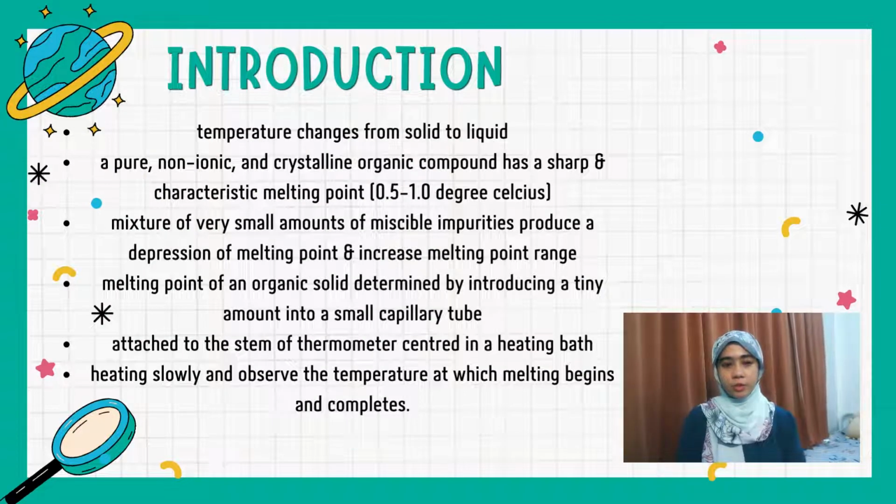Assalamualaikum warahmatullahi wabarakatuh. We are from Group 5 and now we would like to present experiment 2, which is the determination of melting point using the capillary tube method.